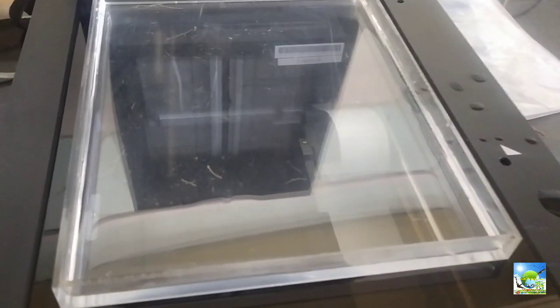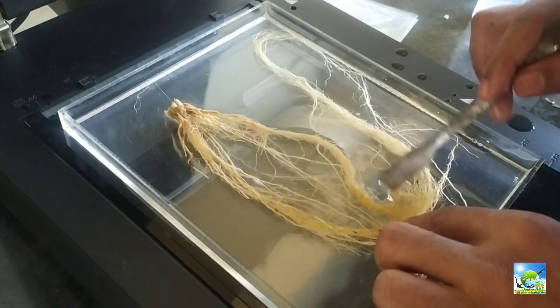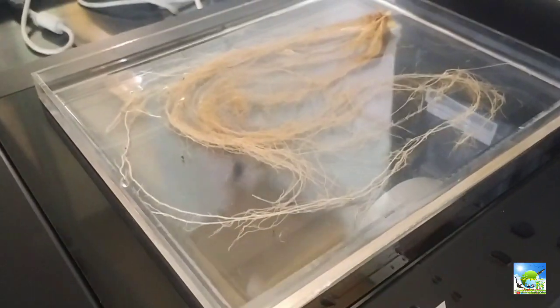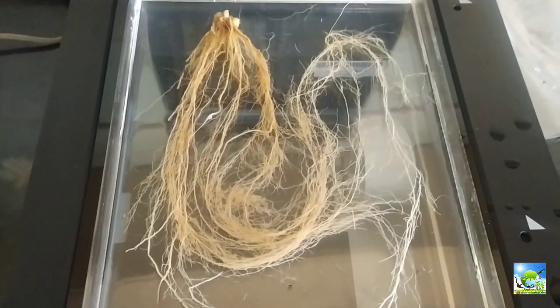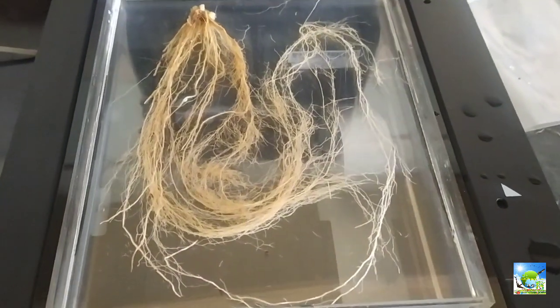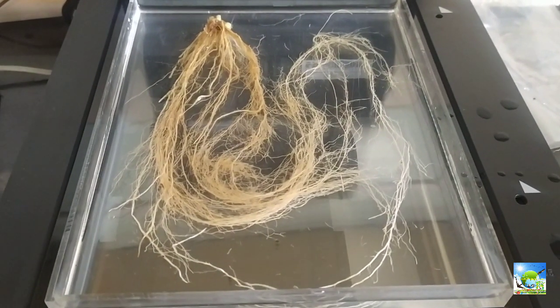Fill the tray with distilled water and keep the roots in the tray and spread them. Do not use ordinary water, as salt may accumulate in the transparent tray, which may erode or corrupt it and will not give good observations. Avoid a bulk of roots as much as possible.